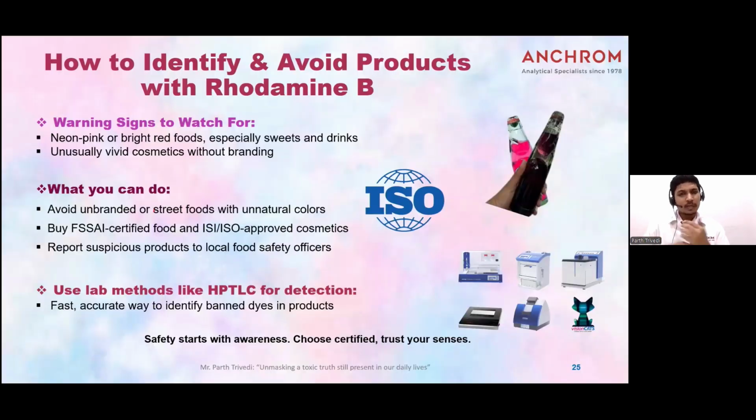Or if you find anything suspicious, you can also contact the local authority officers. And for the lab method, you can go with HPTLC. You have seen how nice it is. You can check the bands and all.